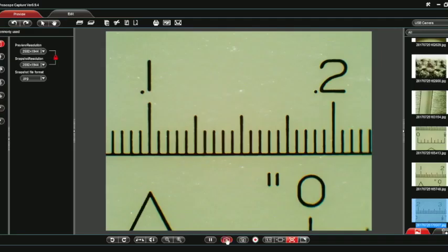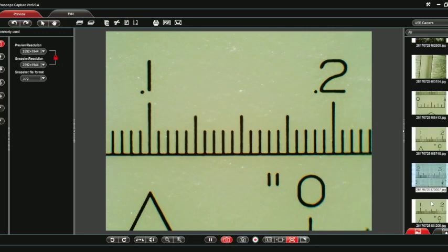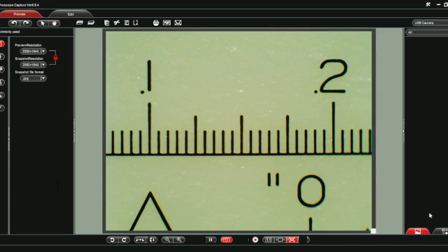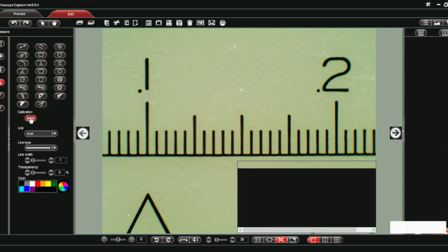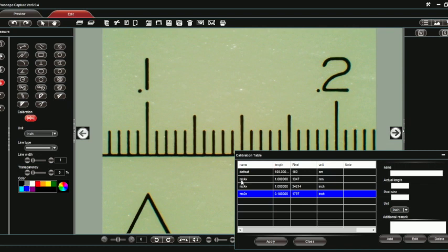I'm going to go ahead and capture an image. It will now show up in the thumbnail list on the right-hand side. I'll double-click that to bring up the image I just captured. In the ProScope capture software, I'm going to go to the measurement section and bring up the calibration table. I'm going to click to the left hash mark of point one, and then click to the left hash mark of point two.